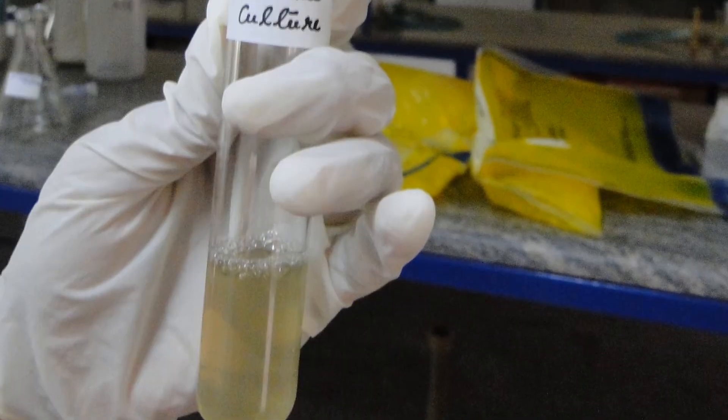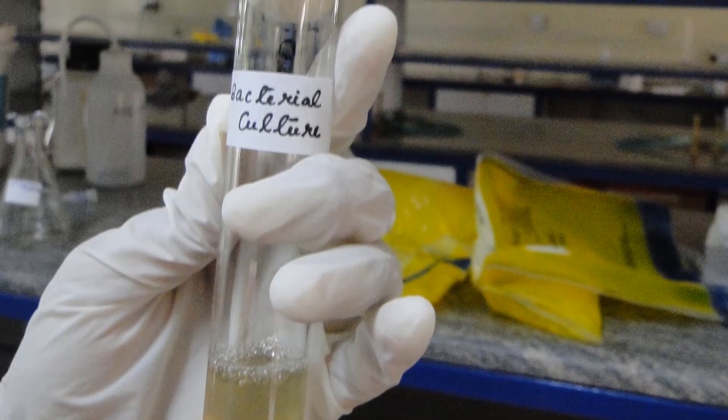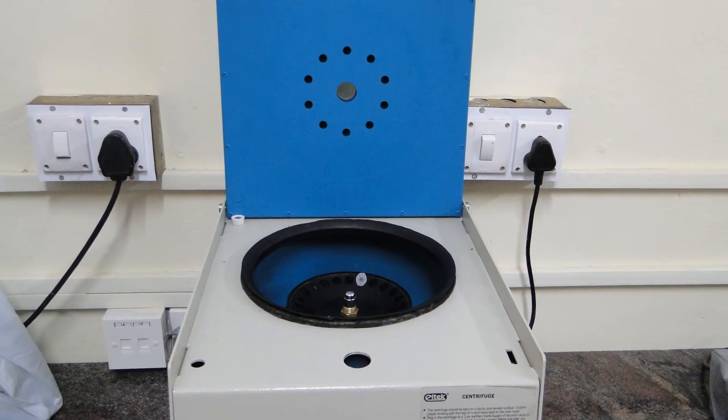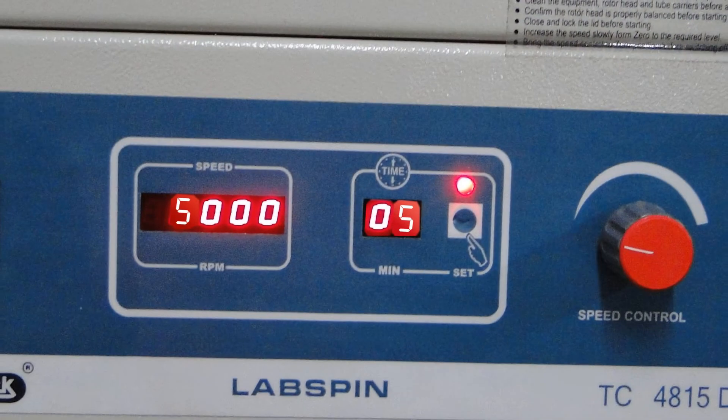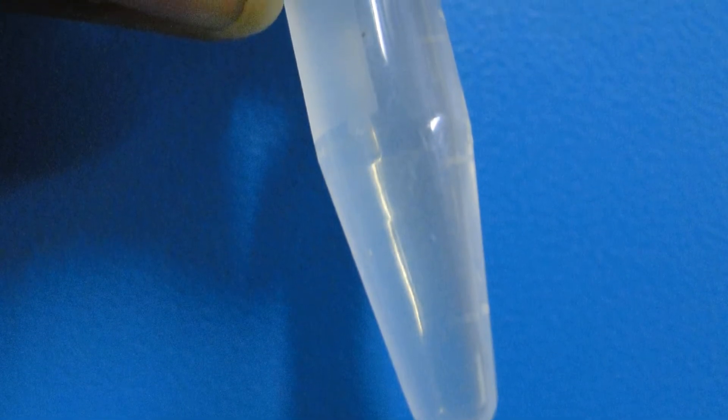Take 1.5 ml or 1,500 microlitre of bacterial culture to a microcentrifuge tube using a micropipette. Centrifuge it at 5000 rpm for 5 minutes at 4 degrees Celsius. We can observe a white colour that settles down near the sides of the vial, which is called a pellet.